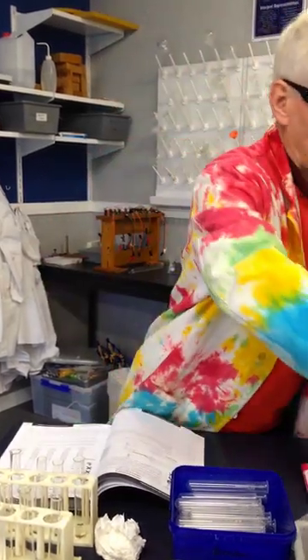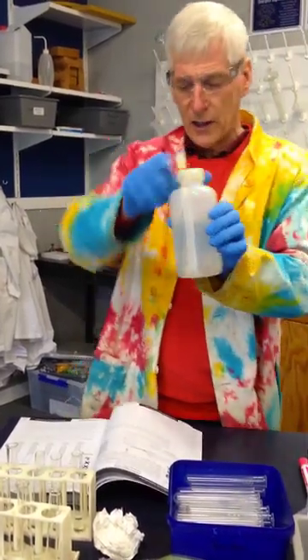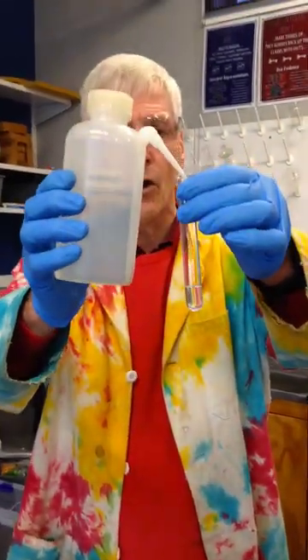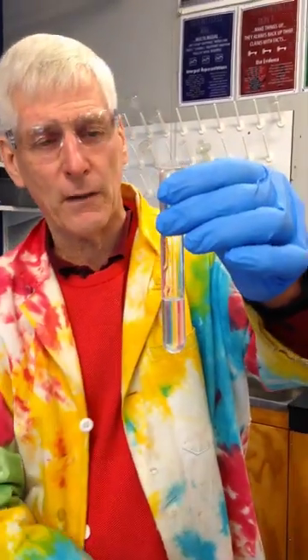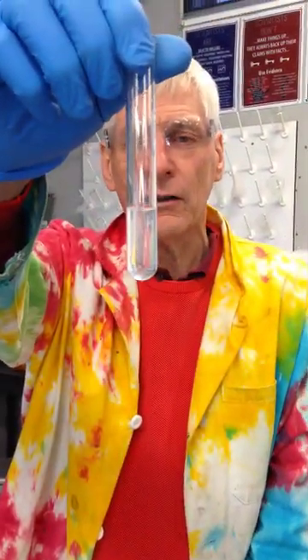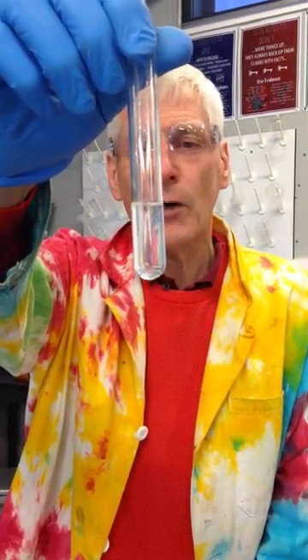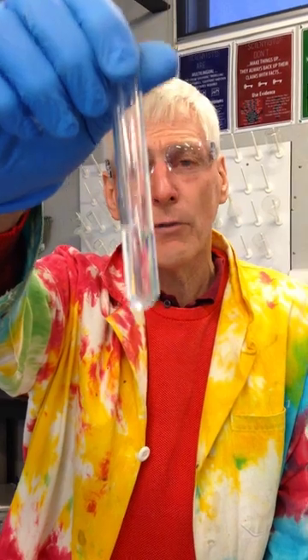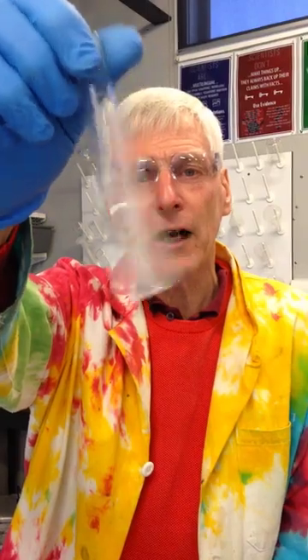So now what I'm going to do is just take my water, and I'm going to place a little bit of water in each of these tubes, and you need to note whether a layer forms or whether they dissolve. So there's ethanol and water, and you can see, I can shake that around, and you can see that there are no separate layers, there's not one liquid sitting on top of the other, and it's formed a homogeneous mixture, which is what we call a solution. So this has actually dissolved and formed a solution, and the ethanol and water are evenly distributed throughout.